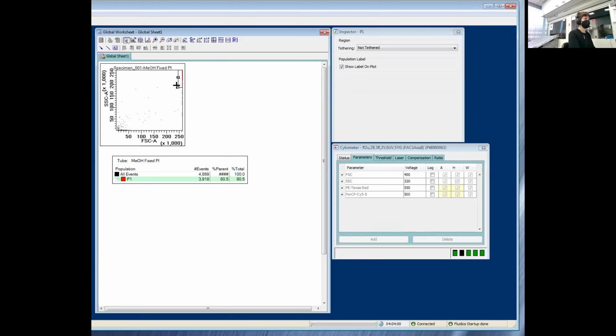and likely the side scatter as well. Okay, so I'm going to go ahead and reduce the forward scatter. Let me try about 300. Then on the acquisition dashboard, I'm going to restart the analysis. Okay, so we see that they're still off scale, so I'm going to bring that down, maybe do about 150. And as I do that, we can start seeing that we have a higher population of cells that are up here.